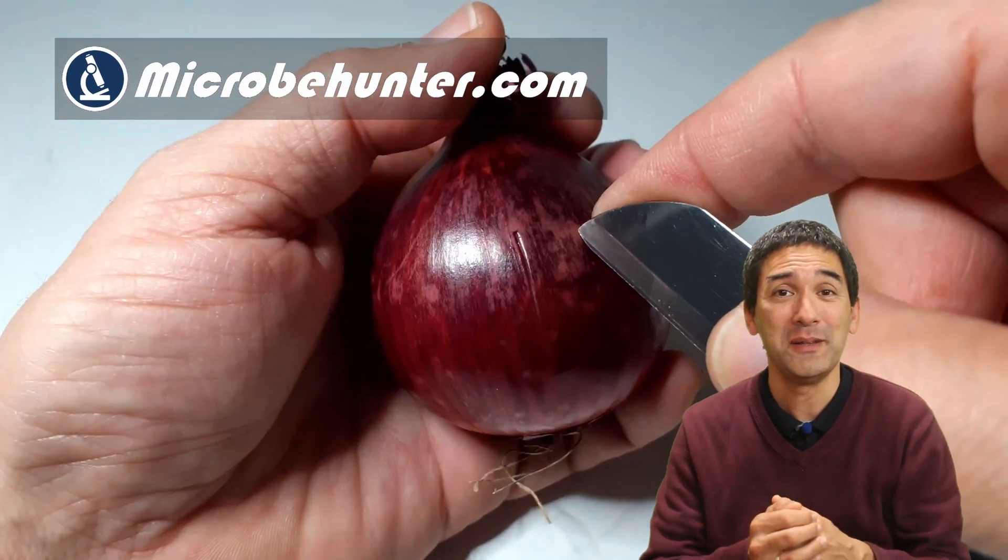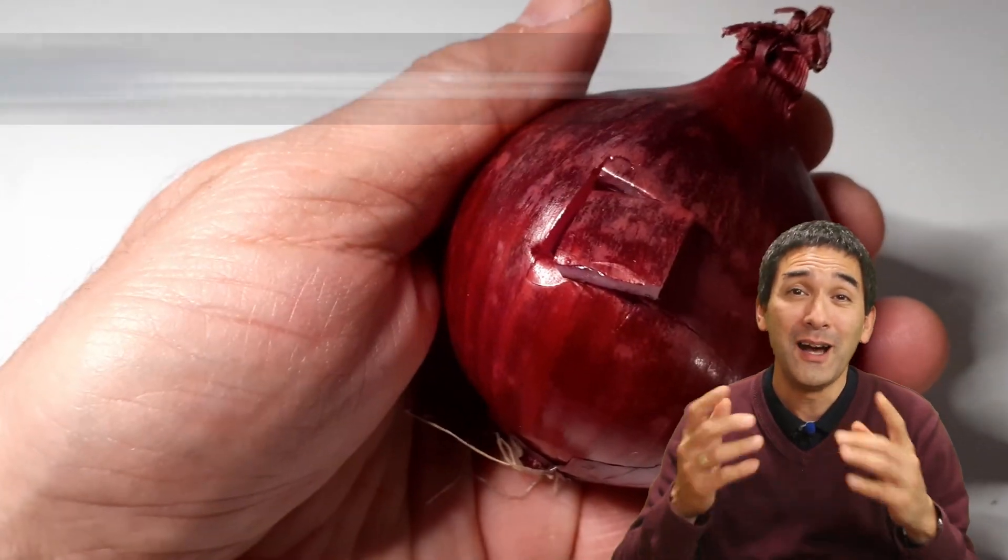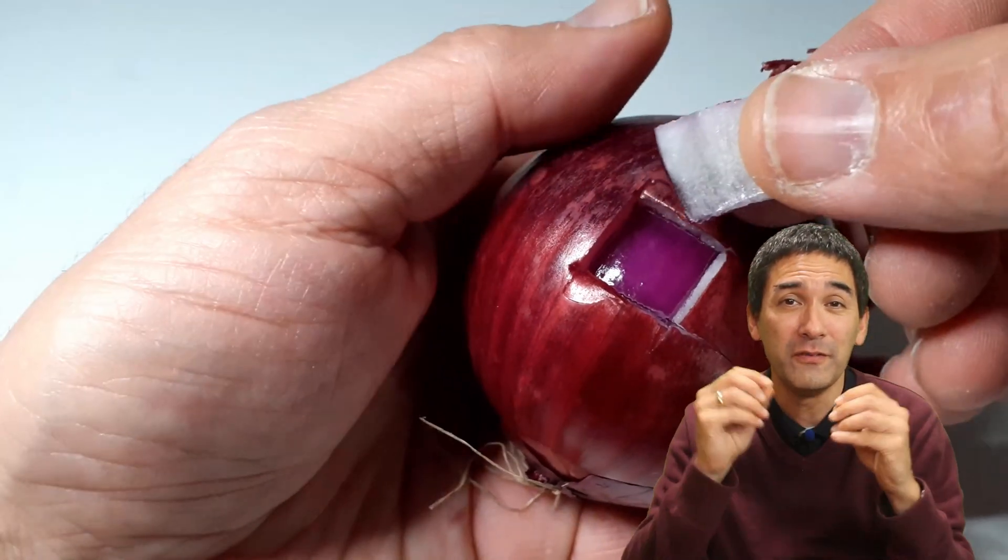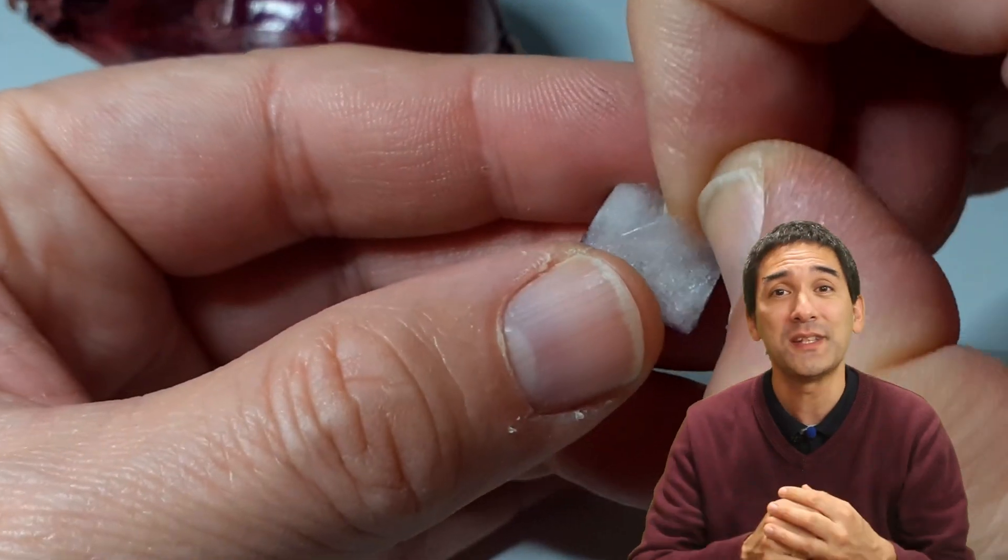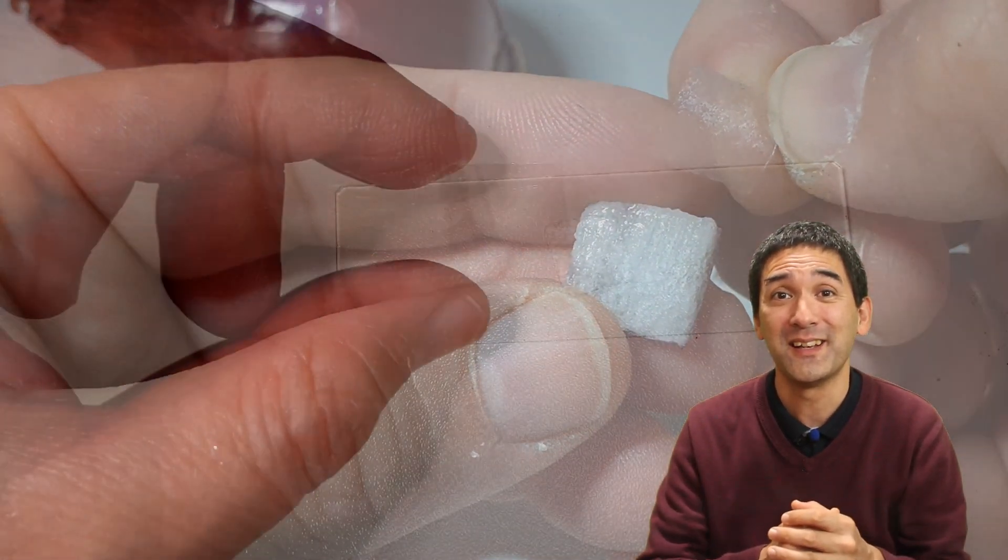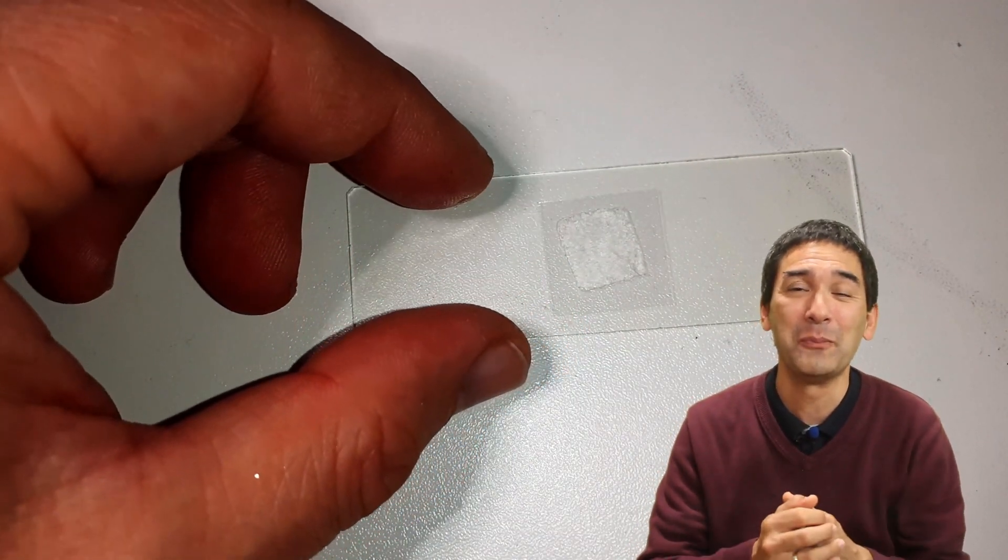I say beginners because they're so easy to prepare. However, I would say that if you actually look at them in very close detail, they have a lot of interesting things to discover. In that sense, onion cells are a little bit underrated, if you allow me to use that term.